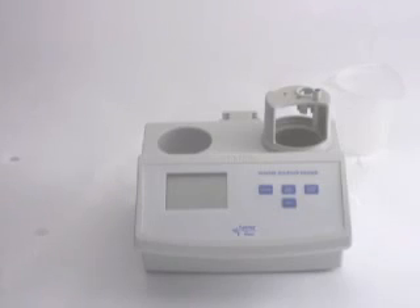Welcome to Hanna Instruments. Today we're going to be going over the setup, calibration, and testing with the HI84100 to test free and total sulfur dioxide in wine.